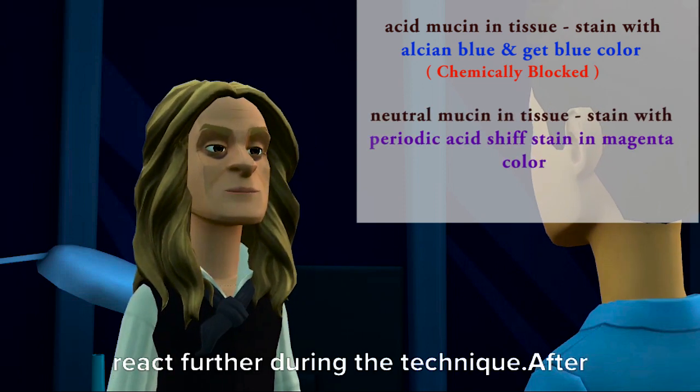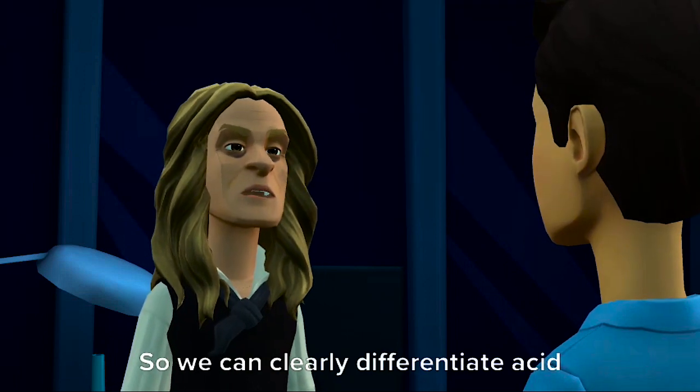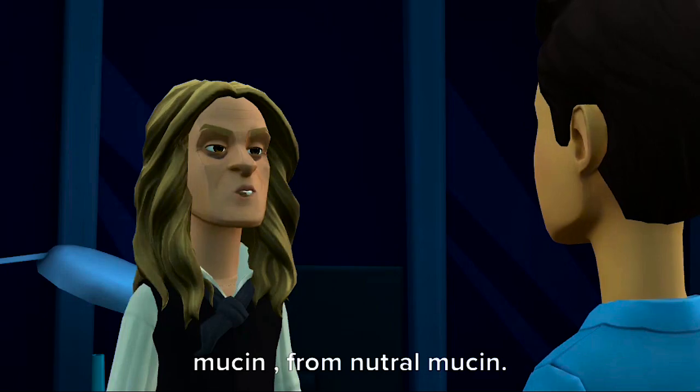After that, neutral mucin stains with the Periodic Acid-Schiff Stain in magenta color, so we can clearly differentiate acid mucin from neutral mucin.